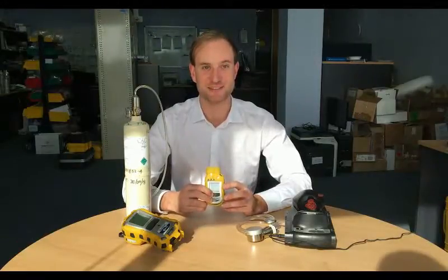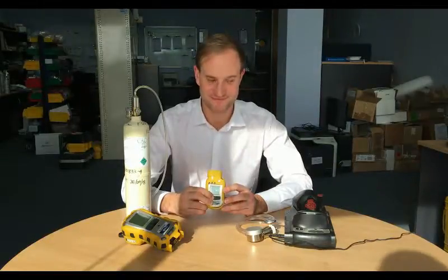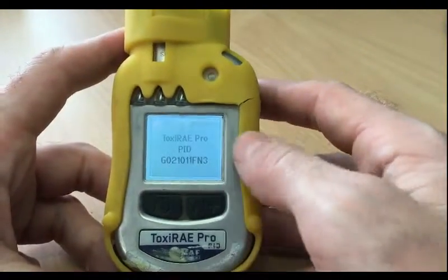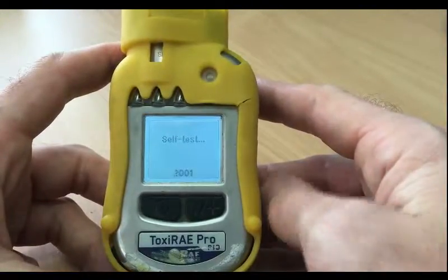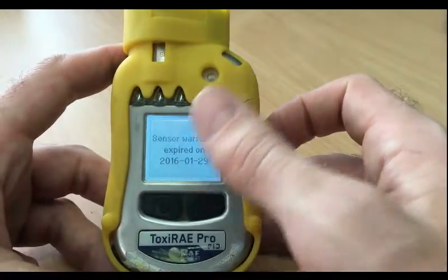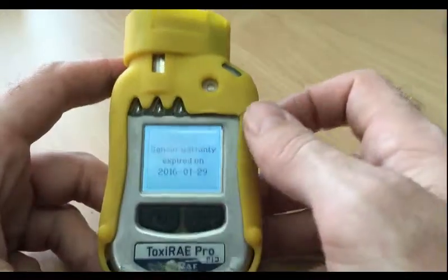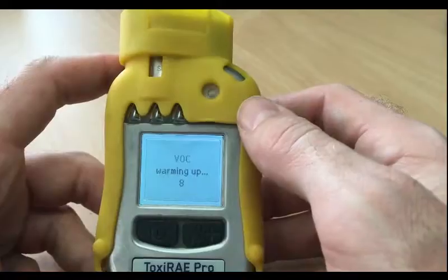First we're just going to turn it on using the button — hold it down for 5 seconds. It turns on. You can see the unit has started. Let's run a self-test; it will tell you when the sensor warranty expires. Now I'm just going to wait for the PID to warm up.